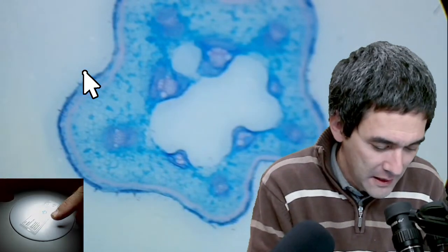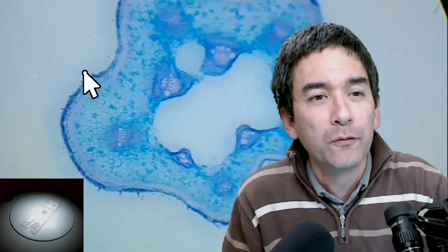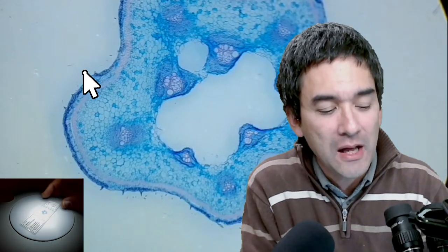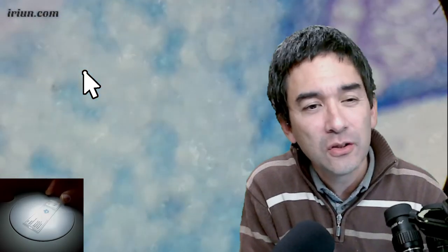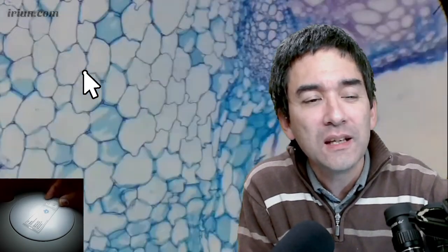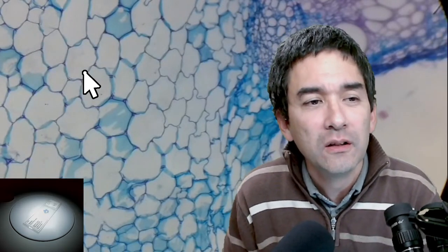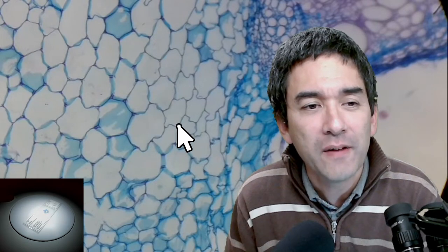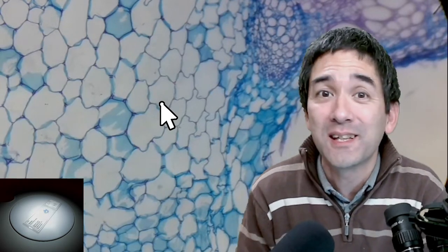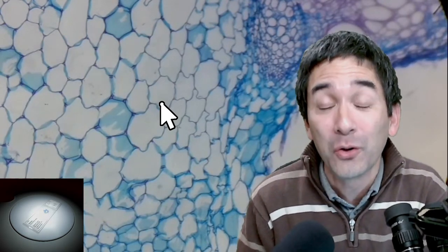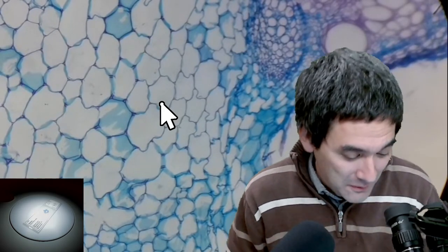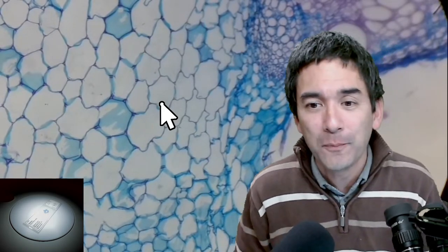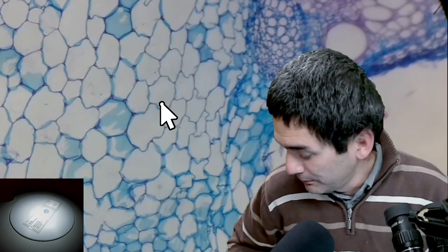I can zoom in on the pumpkin cross section — it goes out of focus each time so I have to refocus. All those structures you see here — see the arrow — that's a cell. Those lines are the cell walls. Short answer: yes, you can see cells. Bacteria are also cells but they're too small to be seen with a stereo microscope.